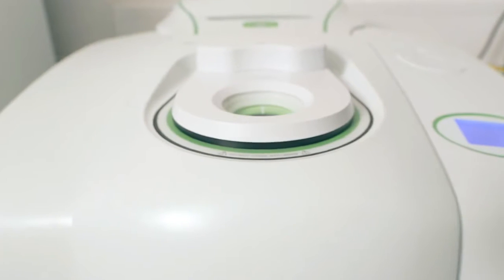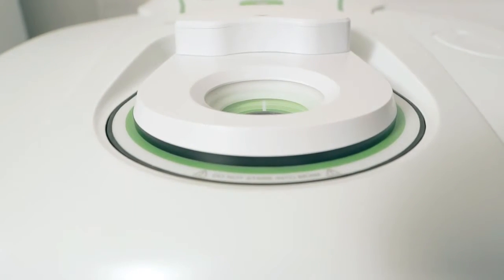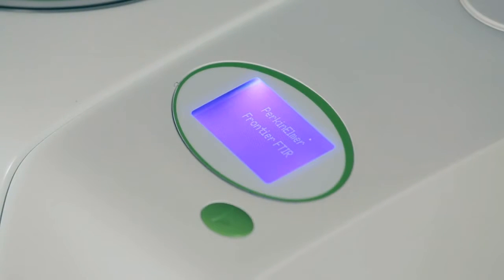If, as we do so, the fit to the sample spectrum greatly improves, that indicates that the adulterant may be present in the sample. Now, the advantage of this approach is that we improve sensitivity by using the adulterant spectrum, but it doesn't require us to prepare a large number of standard samples for each adulterant. And that means that we can cast the net much, much wider. So let's take a look at how easy it is to use.